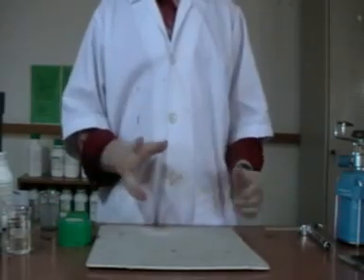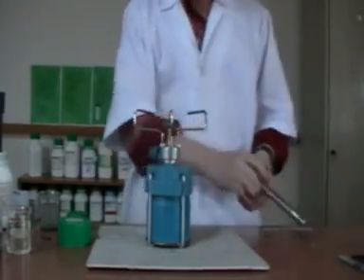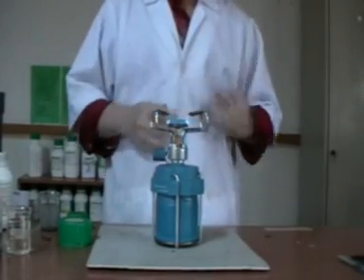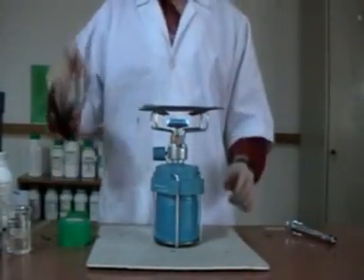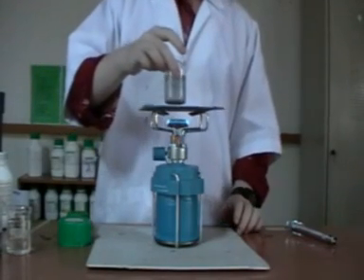After we prepare the solution, we have to boil the solution. This is the solution containing the copper coin inside. We have to boil the solution.